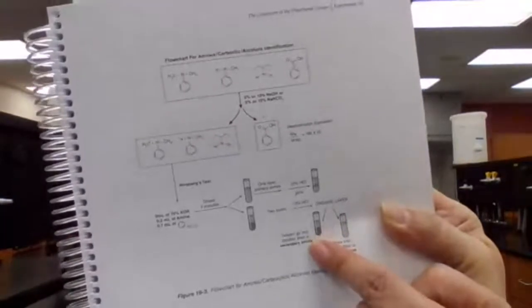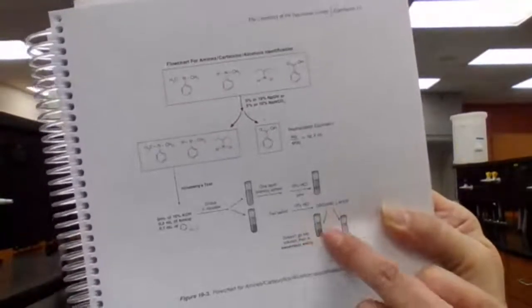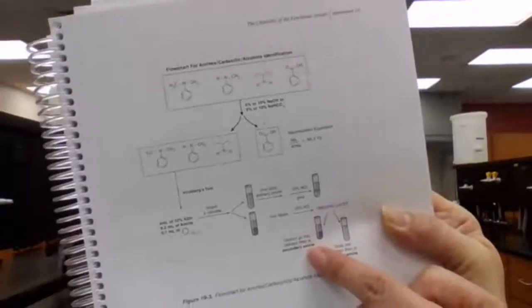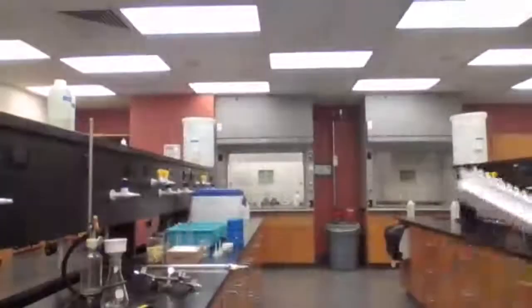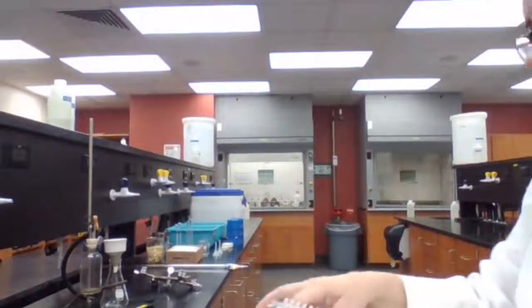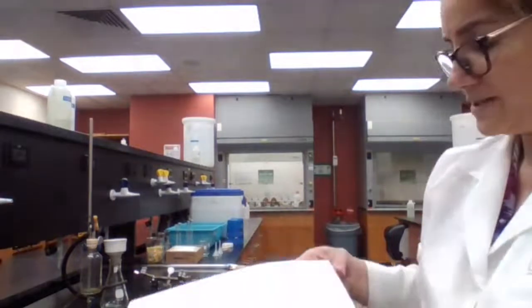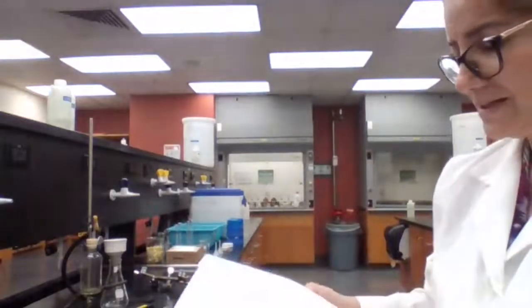If it stays as a two layer, the conclusion is that that is going to be a secondary amine. So we do solubility test, and we are going to test with the Hinsberg test. I hope that we get the answers for the Hinsberg test to make sure that we can distinguish between primary, secondary, and tertiary.